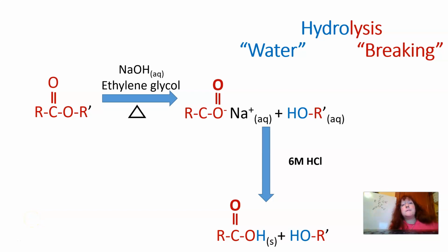Hello, and for the third experiment that you're going to do, you are going to do a hydrolysis reaction, and you're going to do the whole synthesis and analysis, so the full thing this time. And the hydrolysis experiment, or the hydrolysis reaction, literally means breaking with water.